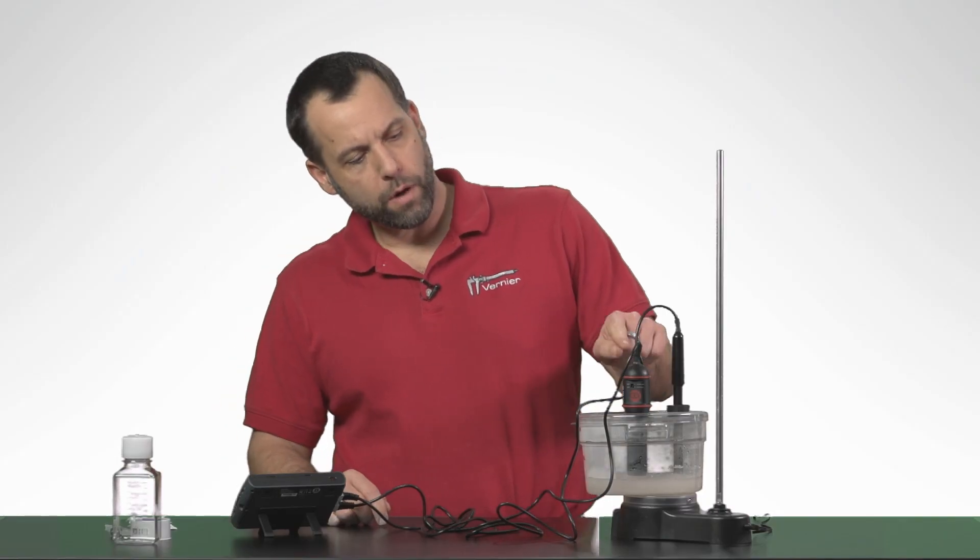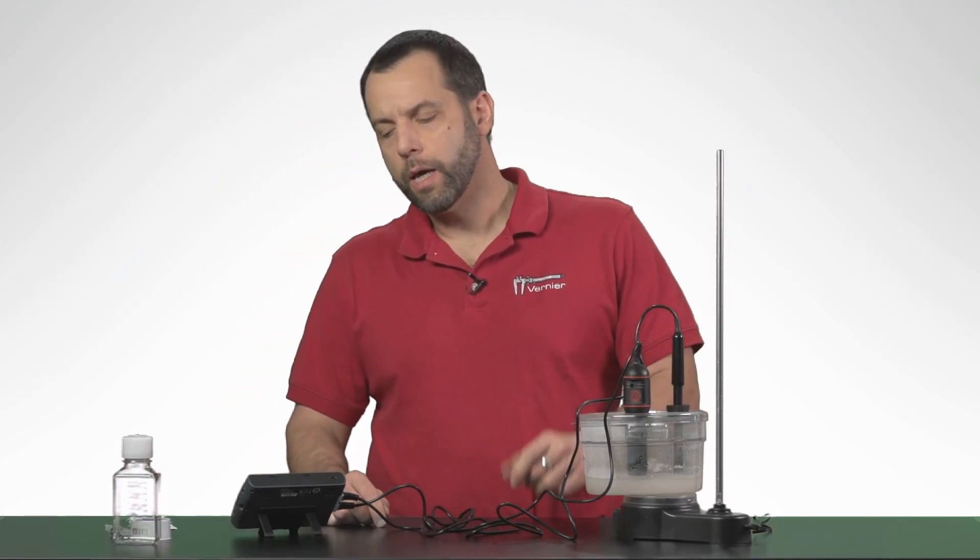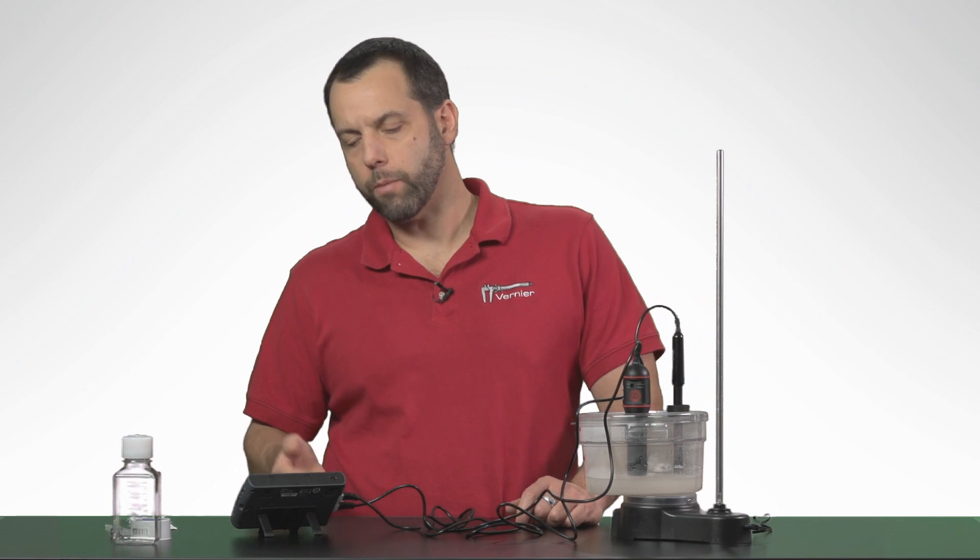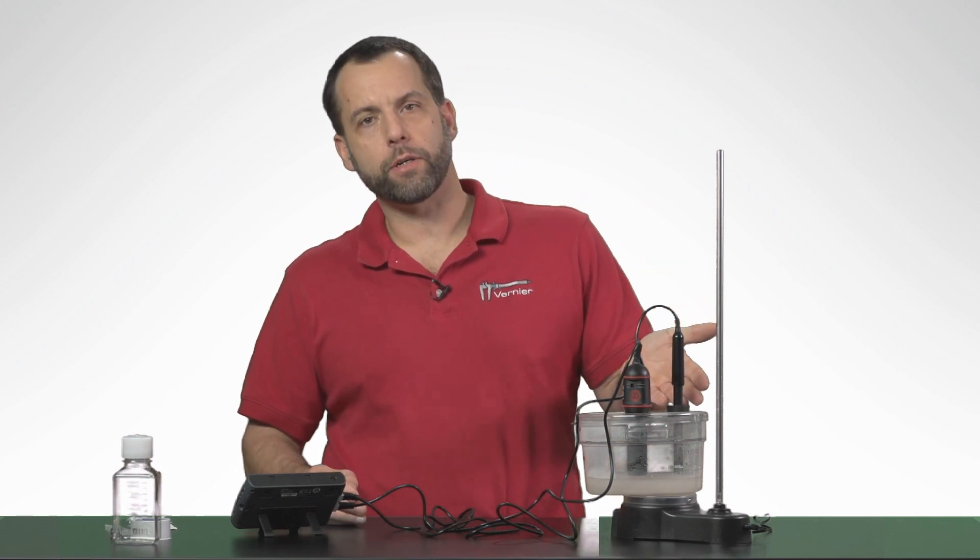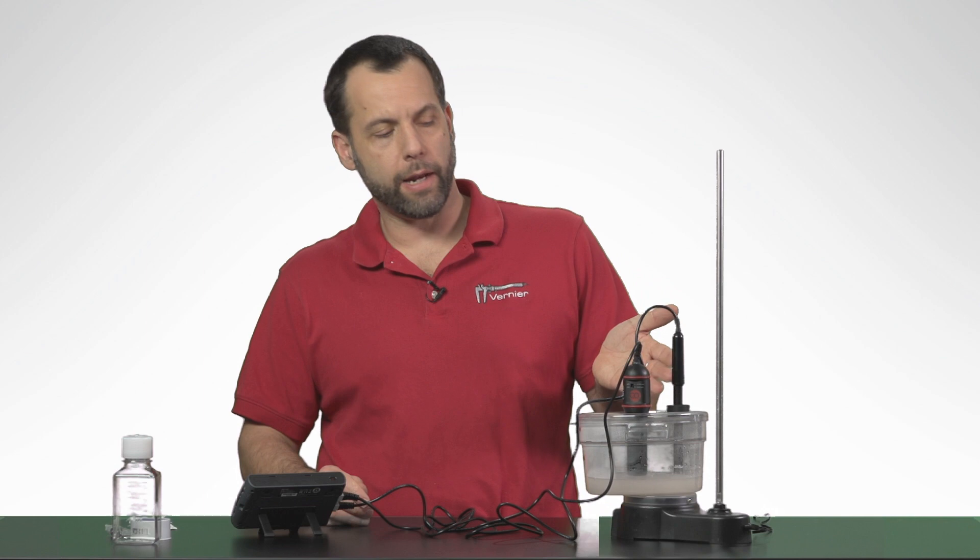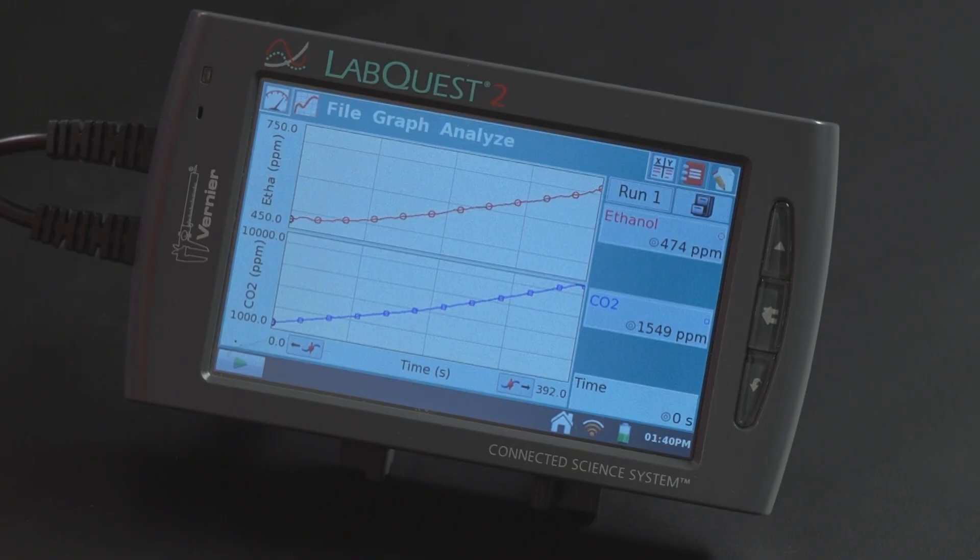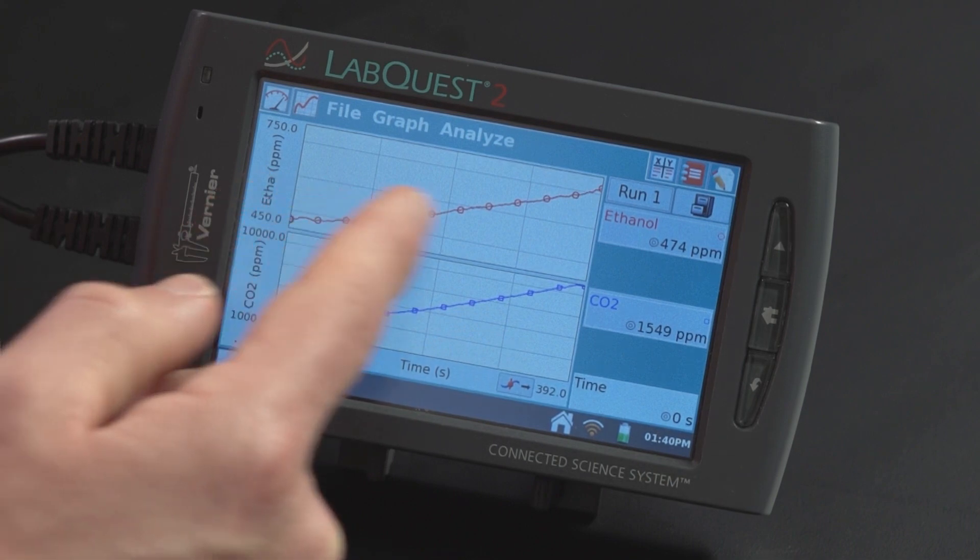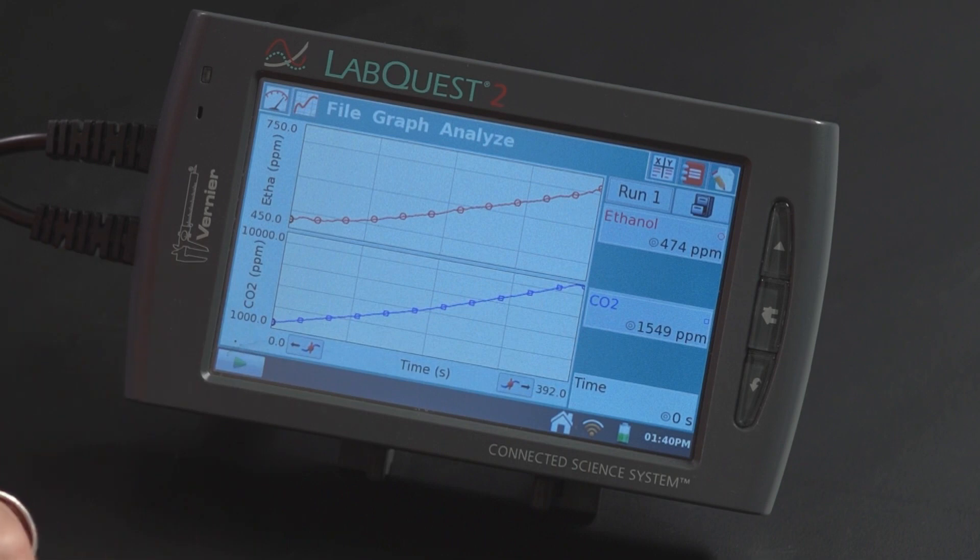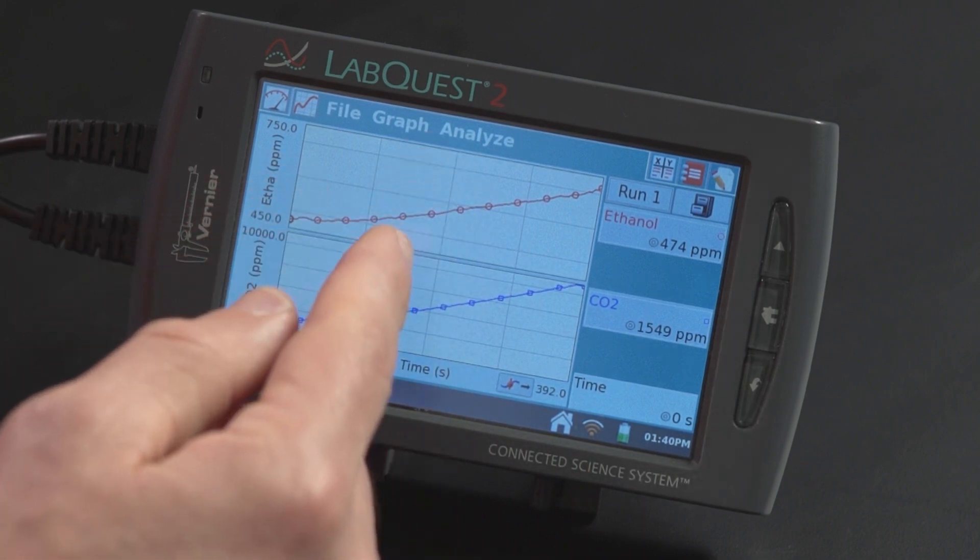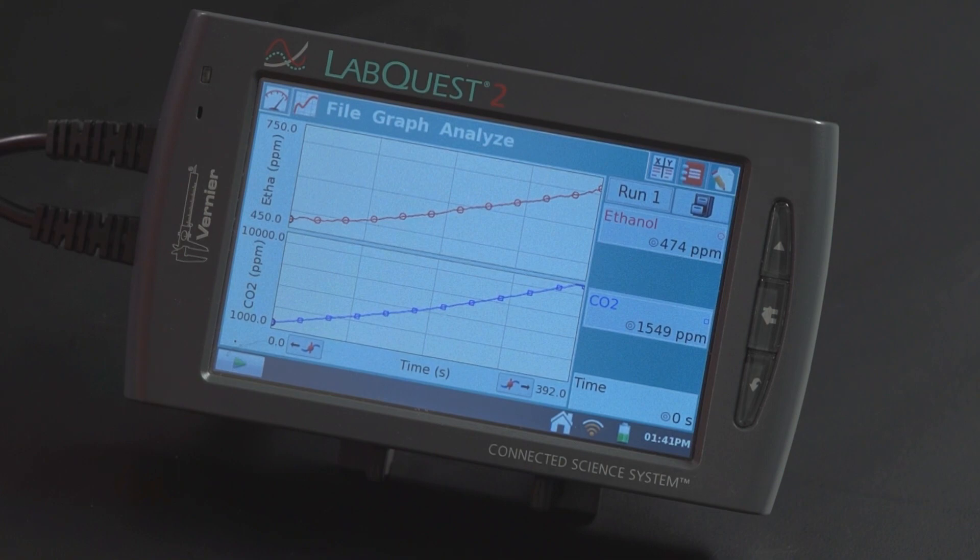Now if you wanted to, you could always take the CO2 sensor and put it on the high setting, but you get a much cleaner response if it's actually on the low setting for yeast. And really what you're trying to see when you're looking at fermentation is that yeast can take sugars and they turn that into carbon dioxide gas and ethanol. You can see that right here on this graph that we have a production of ethanol over time and a production of carbon dioxide over time. And if we wanted to, we could look at the rate of ethanol production and CO2 production over time.